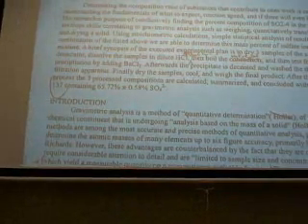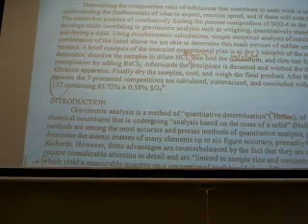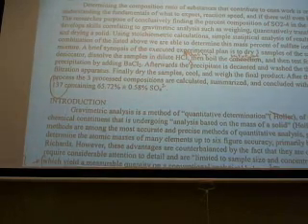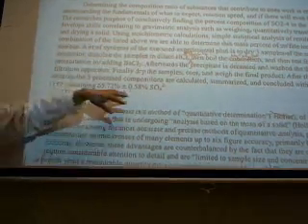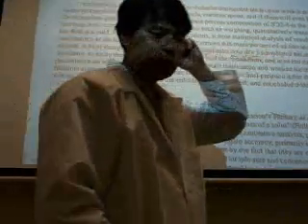Washed through the vacuum filtration apparatus. Finally, the dry samples cool and weigh the final product. After this laborious process, the 3 process compositions are calculated, summarized, and concluded with the unknown number 137 containing 65.72 plus or minus 0.58%. You don't need 2 percentages here, percent sulfate.